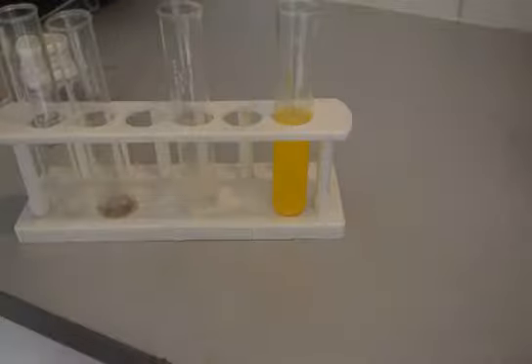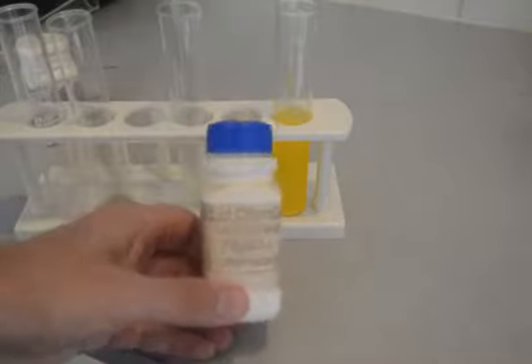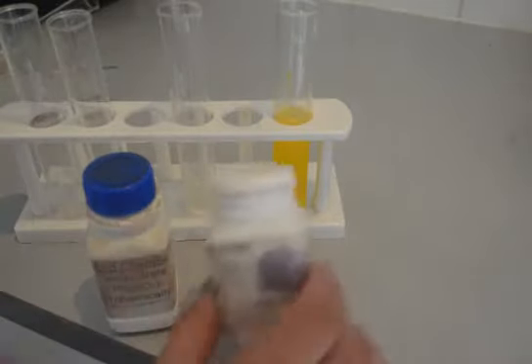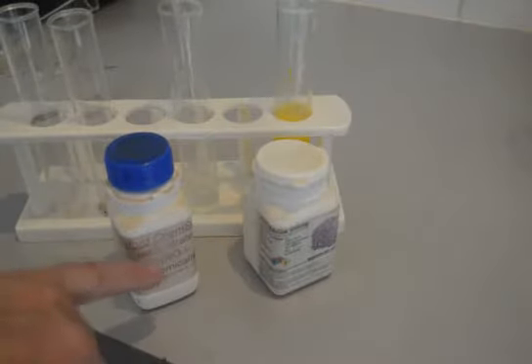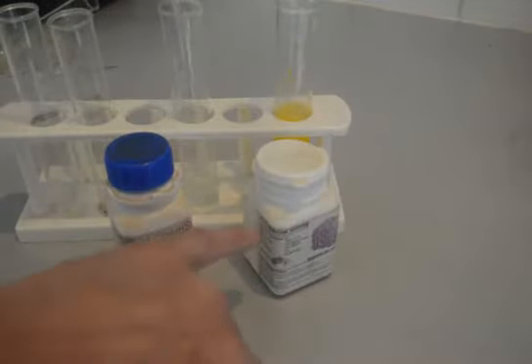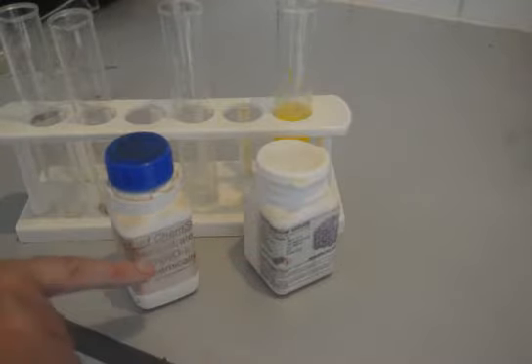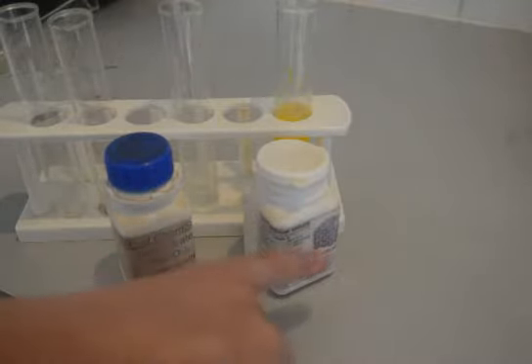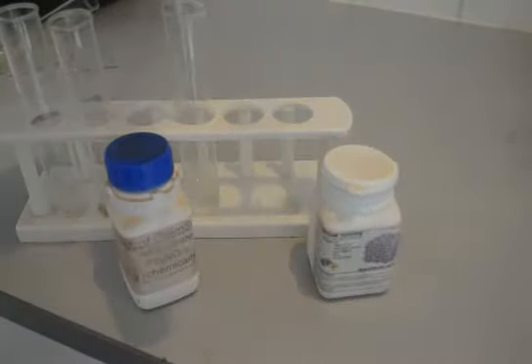Right, so I just had to look up quickly to remind myself which of the new compounds actually precipitated out, and it's the lead iodide. So we've got lead nitrate there and potassium iodide there. So the two compounds formed in the reaction are lead iodide and potassium nitrate. Now it's a lead iodide because lead is a very large molecule, and when it forms with iodide, that comes out of solution, and that's when you get this.